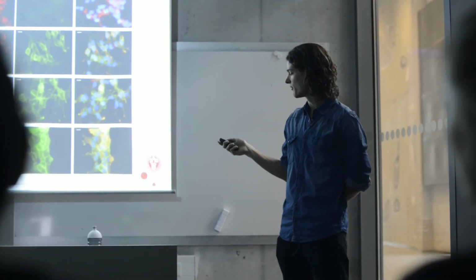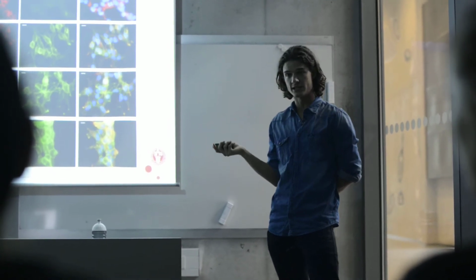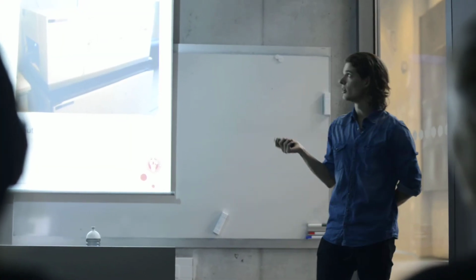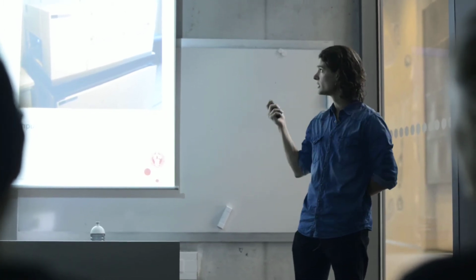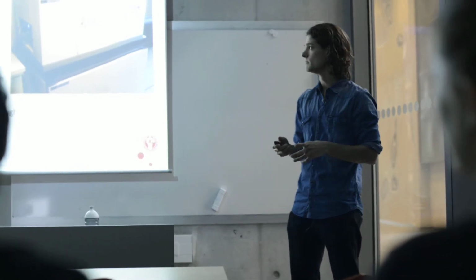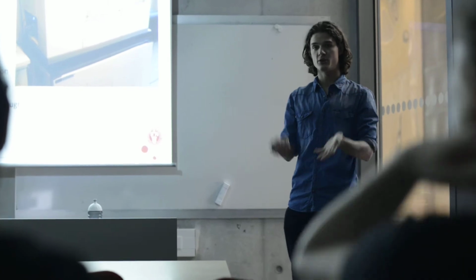So, after this step, we decided we had to measure the activity of NBC1 variants relative to wild type. And how do we do this? I used an Opera system, which has a chamber which allows you to adjust the temperature, humidity, and carbon dioxide levels. And by usage of 96 well plates, allows you to analyze many clones at one time. And it has different filters for emission. It has 3 cameras, which allows you to simultaneously measure emission at different wavelengths, several lasers for excitation.